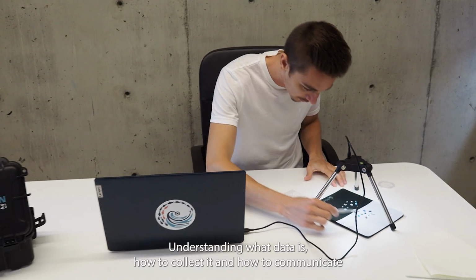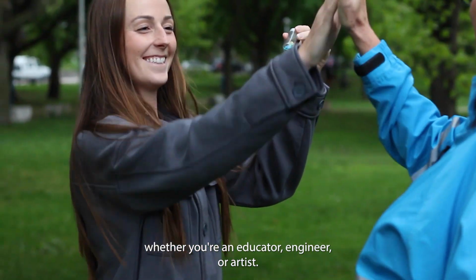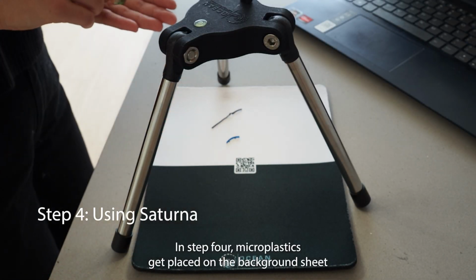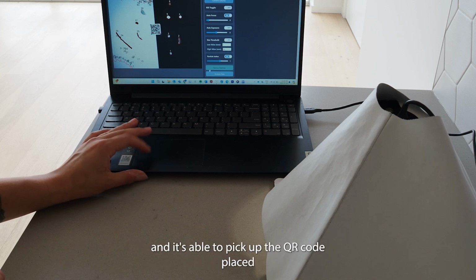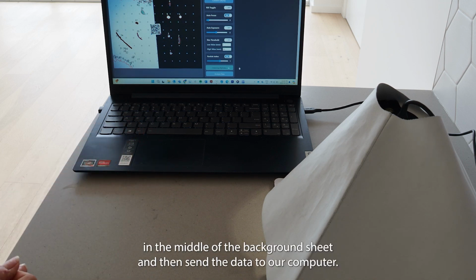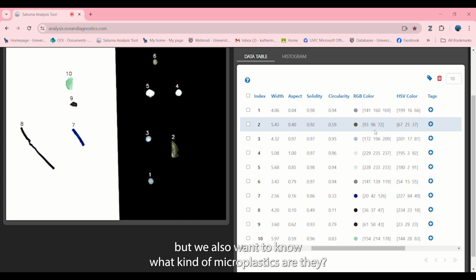Understanding what data is, how to collect it, and how to communicate it is an important skill, whether you're an educator, engineer, or artist. In step 4, microplastics get placed on the background sheet so that Saturna is able to pick them up easier. The shroud then gets placed over Saturna so that the light can be concentrated and it's able to pick up the QR code placed in the middle of the background sheet and then send the data to our computer.